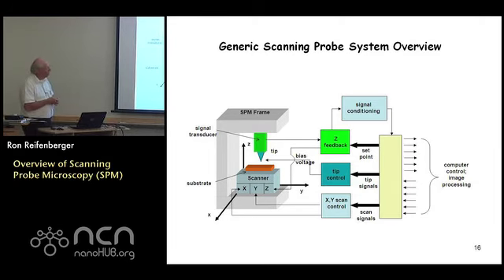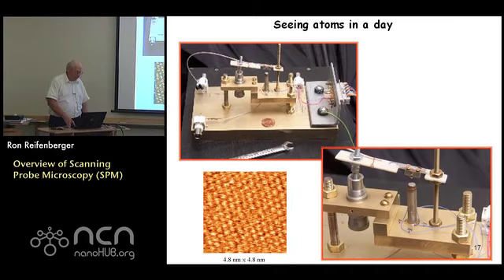So the hard part is learning the computer control software. Every system, every AFM that you sit down and use is going to have a different set of assumptions and approximations and subroutines, and you have to master all that and make it work as a whole. The systems are getting much better now than they were 20, 30 years ago. Everything's becoming much more integrated, which makes it easier for you as a student to use these instruments. But it still requires a few months of practice.